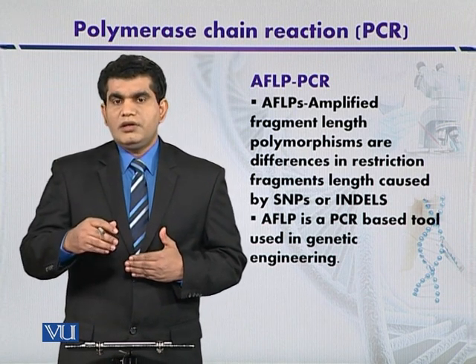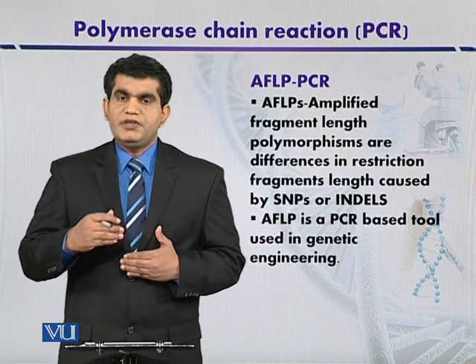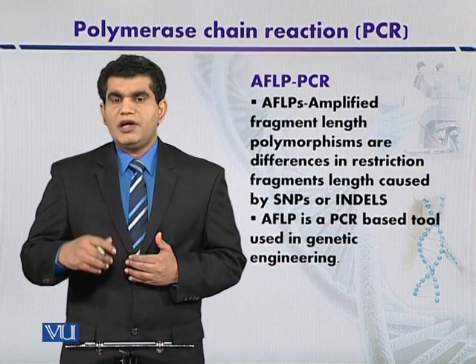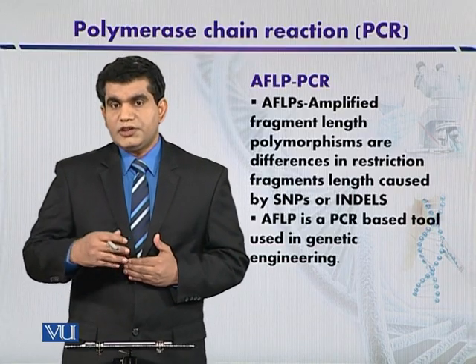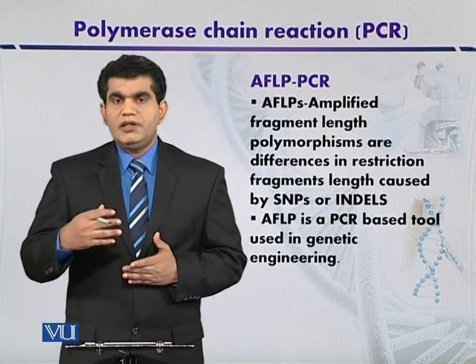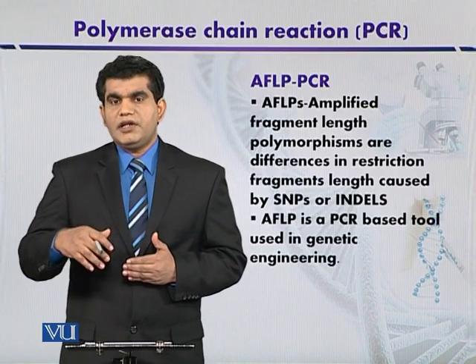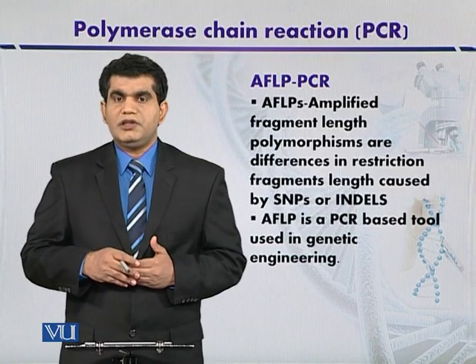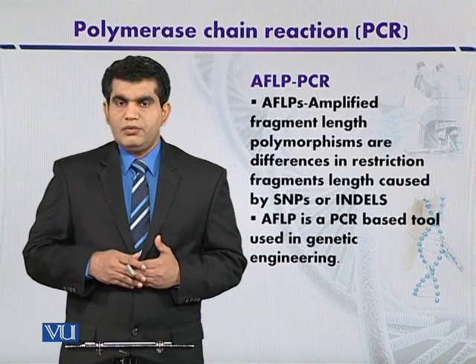So in AFLP we are using the PCR so that we can enhance the sensitivity of the procedure. And this technique was developed in early 1990s, and it also finds its application in the field of genetic engineering or genetics and molecular biology.